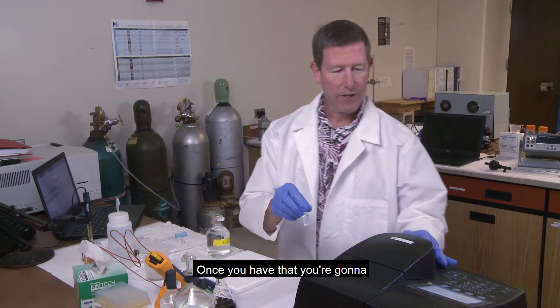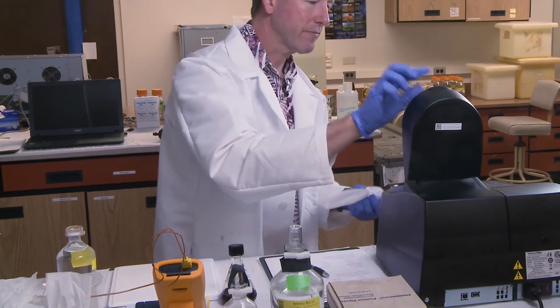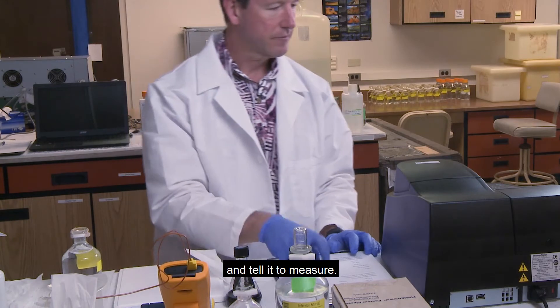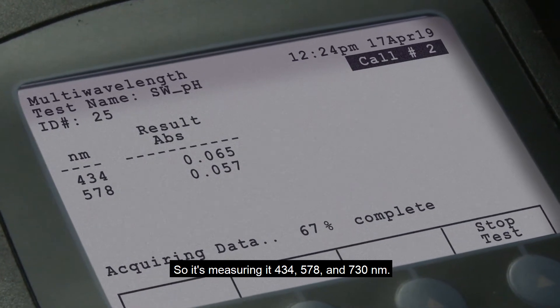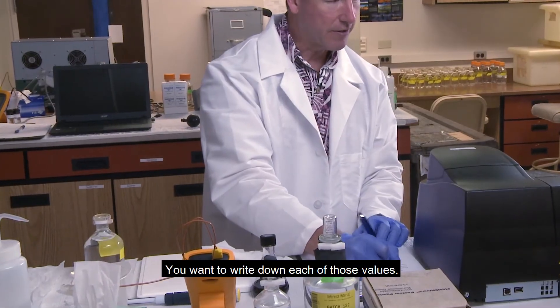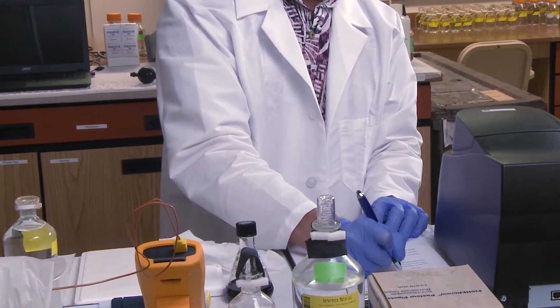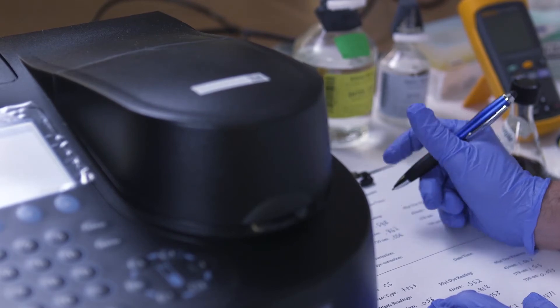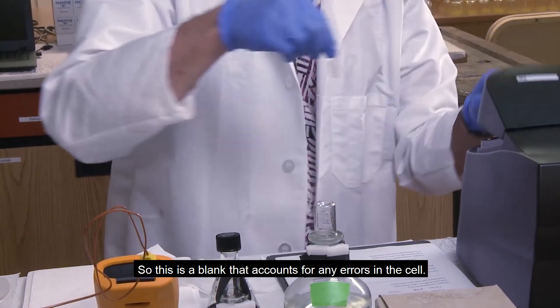Once you have that, you're going to put this into the spectrophotometer and tell it to measure. It's measuring at 434, 578, and 730 nanometers. You want to write down each of those values. This is a blank that accounts for any errors in the cell.